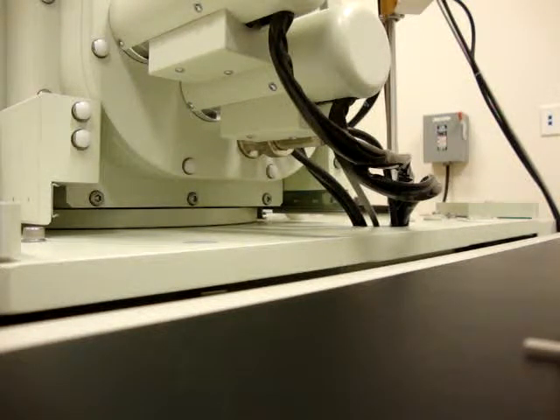Do you save it in the SEM user folder or anywhere you want? I generally save it under SEM images. Under that there's a bunch of folders, like video and music. But you set things up. I just do it under images. Oh, really? You wouldn't just make a folder on the desktop? You can. Just save it to your desktop with your name on it? Yeah, but the desktop gets kind of cluttered. Yeah, that's what happened with the 61.